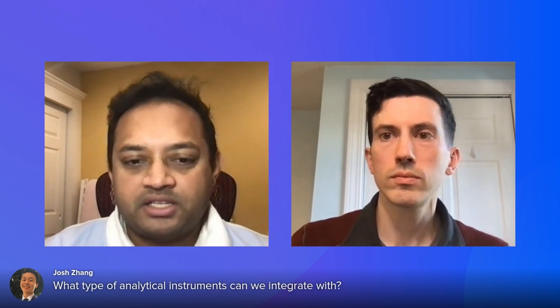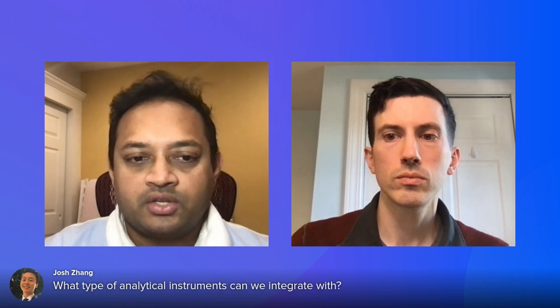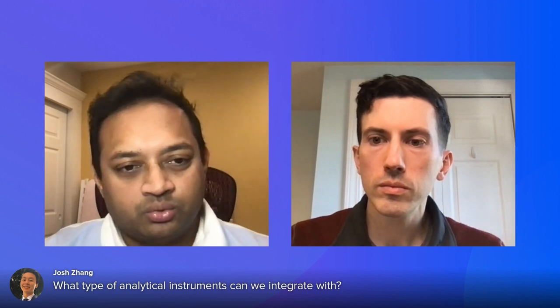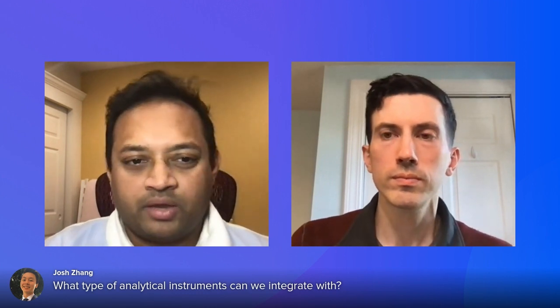REST APIs are a very common standard for interfacing between data systems. Because of that, we can integrate with a wide range of analytical instruments, from plate readers to smart freezers and analytical instruments. So I don't think there is any limit to which particular ones we can or cannot.